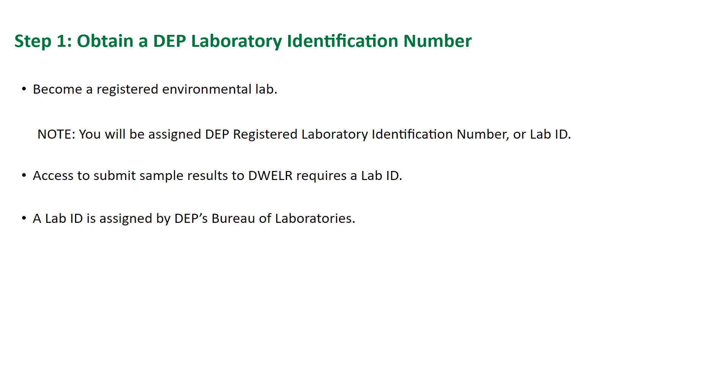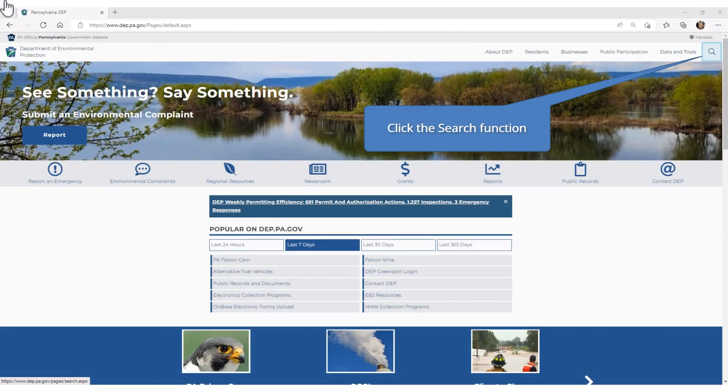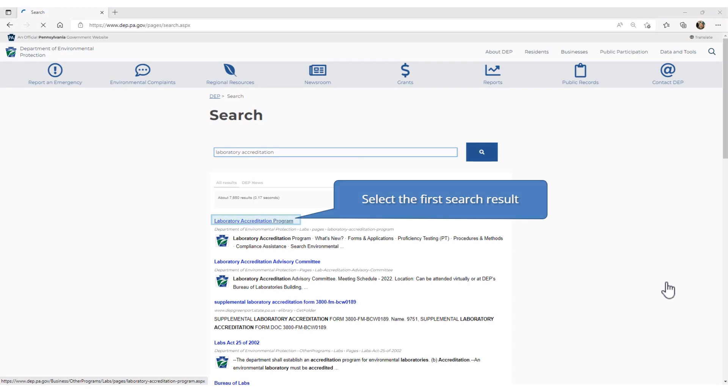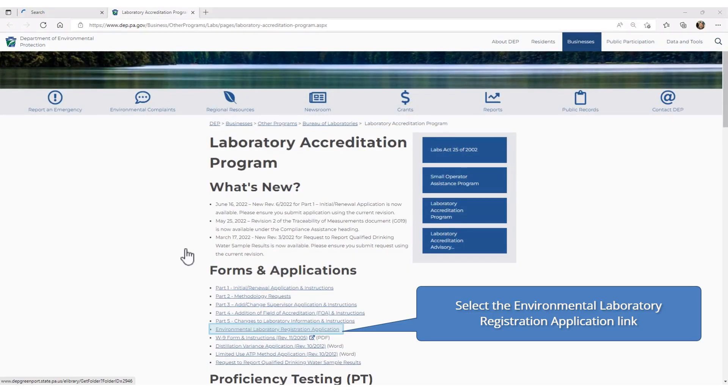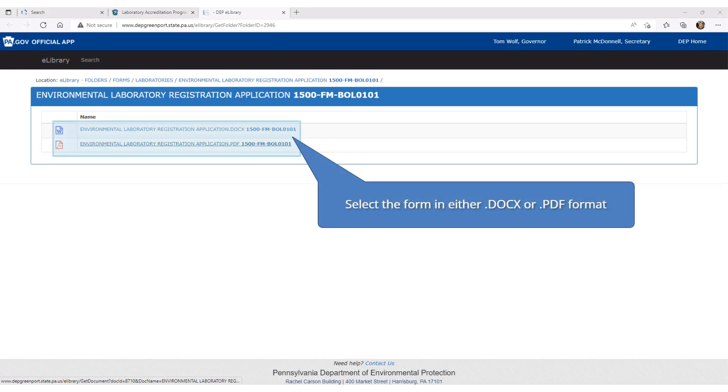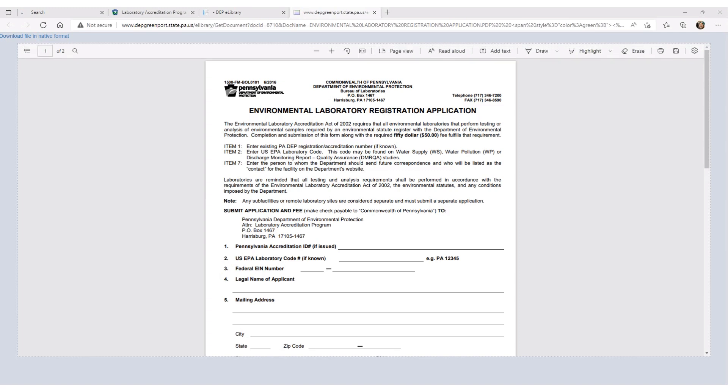A lab ID is assigned by DEP's Bureau of Laboratories. Let's take a look at how you can obtain a lab ID. On DEP's main website, click the search function. Search for Laboratory Accreditation. Select the first search result displayed. Scroll down to the Forms and Applications section. Select the Environmental Laboratory Registration Application link. You are now in DEP's eLibrary system. You can select the application form in either Microsoft Word format or as a PDF.